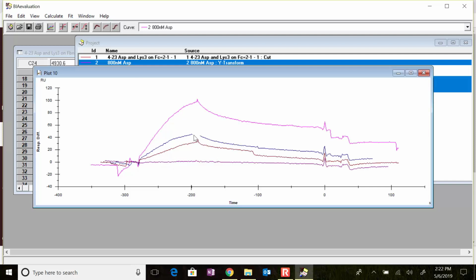Remember, equilibrium, at first you're going to be changing quickly, and that's going to be when you're measuring kinetics, but then the system's going to slow down. It's still binding and unbinding, but it's binding and unbinding at the same rate. You don't see the system changing anymore. And so this part of the curve is closer to equilibrium than that part of the curve. And that's what you're going to measure for lab 3.